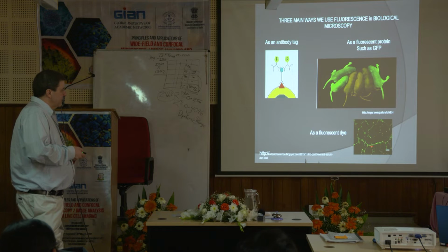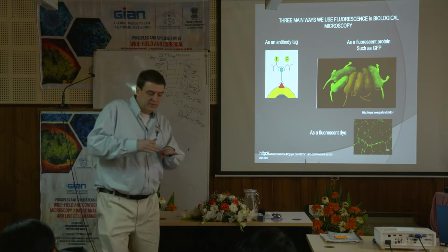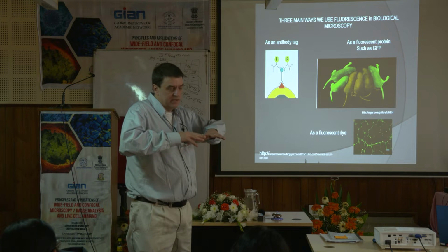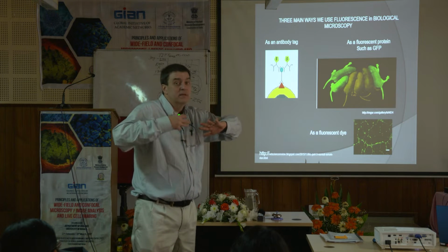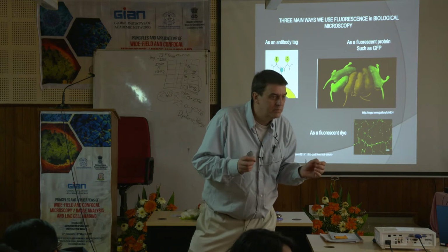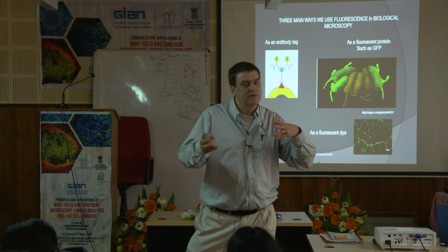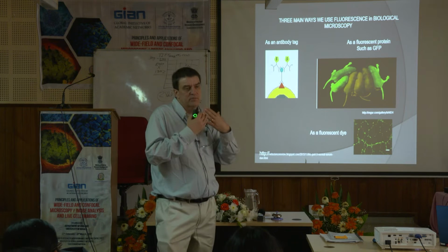This particular example here was in my lab. This was an angiogenesis assay where they would take cells and they would grow them in a gel, like a matrix gel. And they were trying to figure out how these cells would form patterns, angiogenesis. Angiogenesis means, what's angio mean? Any ideas? What was that? Right, angio, like starting, beginning, like Genesis is starting, beginning, angios with blood, heart. So this is an assay to look at how blood vessels form.